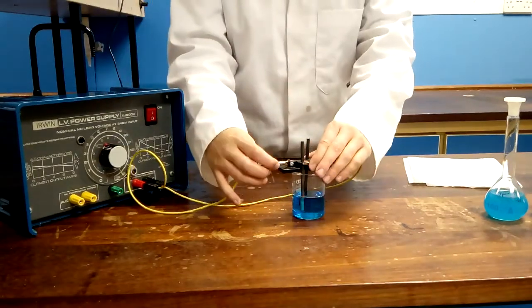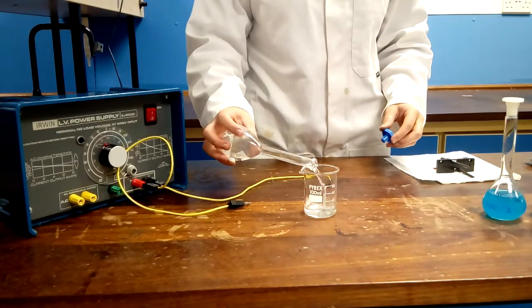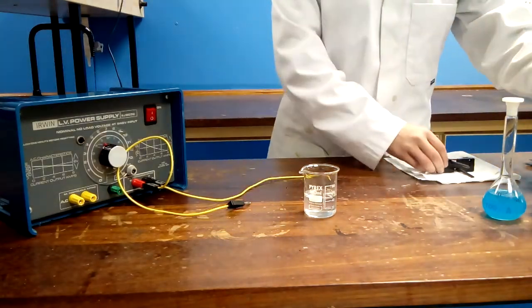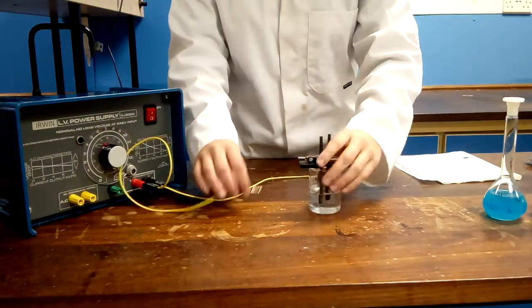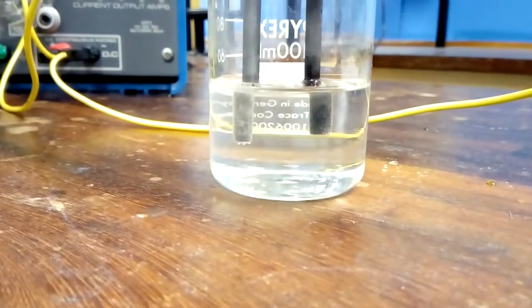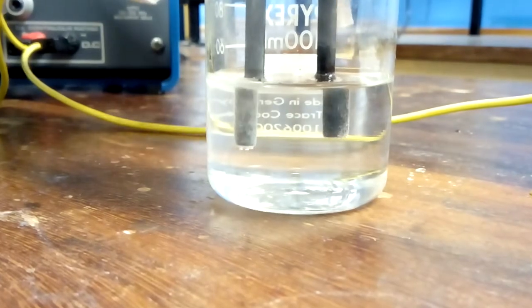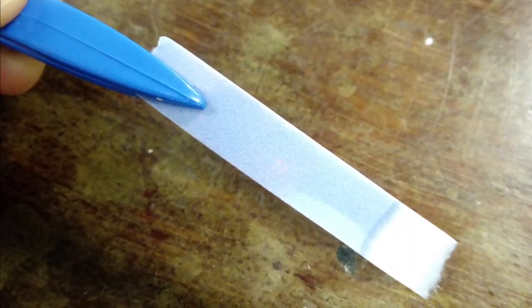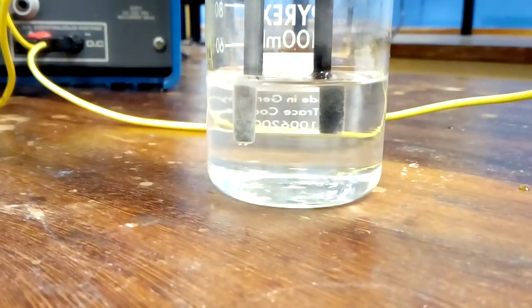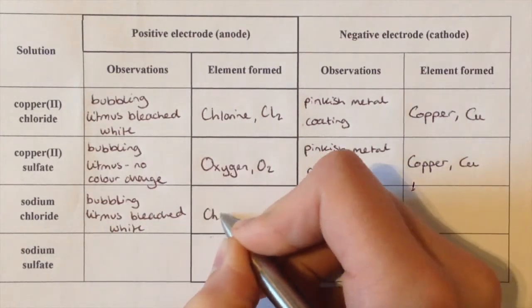After switching off and cleaning your equipment again, repeat the setup with sodium chloride. Bubbles are produced at both electrodes here. The blue litmus paper bleaches white when dipped into the solution next to the anode, and this time there is no metal deposit on the cathode, but a gas has been produced. This must be hydrogen. Again, complete the table provided with your observations.